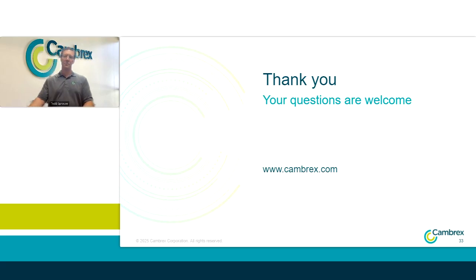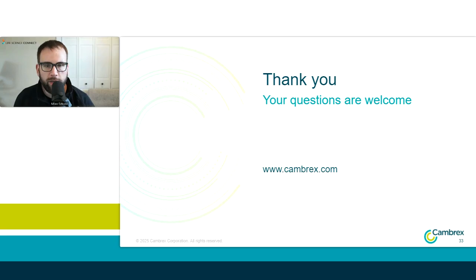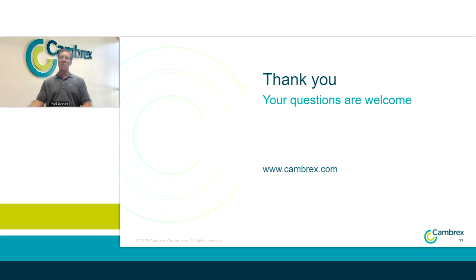Gotcha. And so along those lines, Ranjan asked, are non-GMP nitrosamine tests acceptable for the regulatory agency? Have you seen that? Yes, I have. We write method development reports. Within that, we show that the method is suitable for its intended purpose. So we'll show linearity and LOQ levels and have the spike accuracy. So really running an informal validation within the development report itself, and yes, submit non-GMP testing. And we've had that accepted by the FDA and the EMA for our clients.